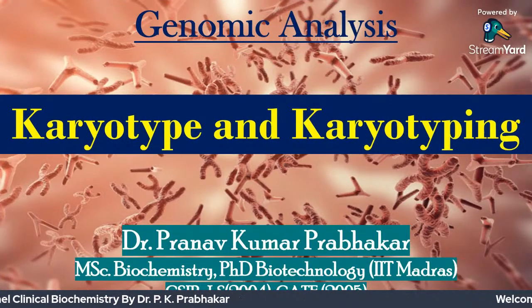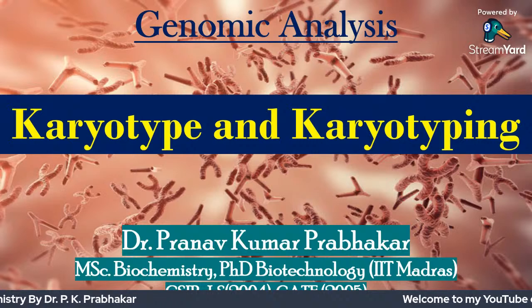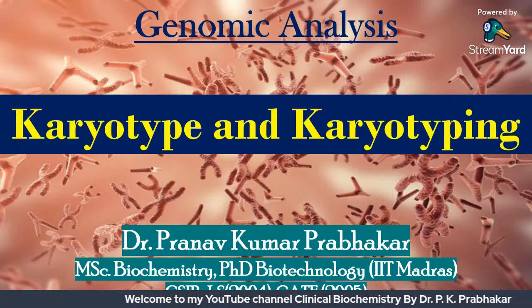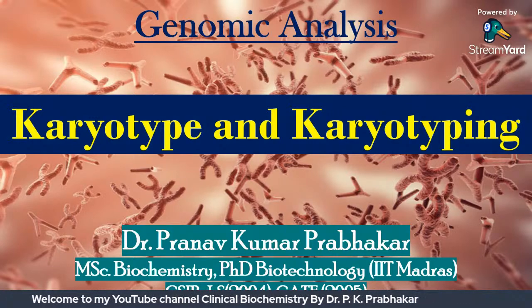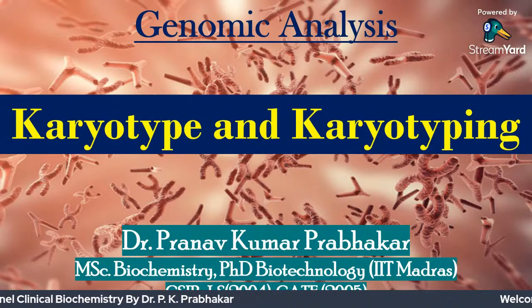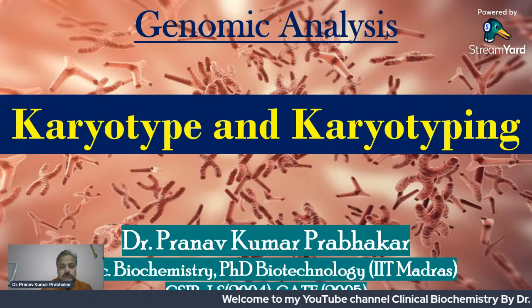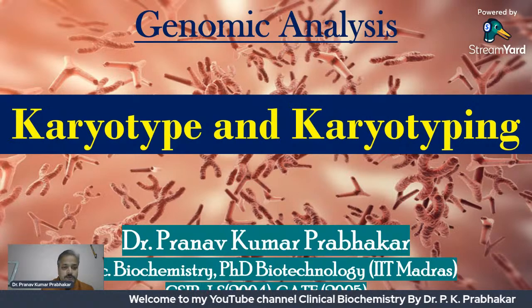So, what is a karyotype? Probably you might have heard about karyotyping. Karyotyping is a process of preparing, arranging and categorizing chromosomes using cell culture techniques. So we are doing cell culture, and then we do this karyotyping process.